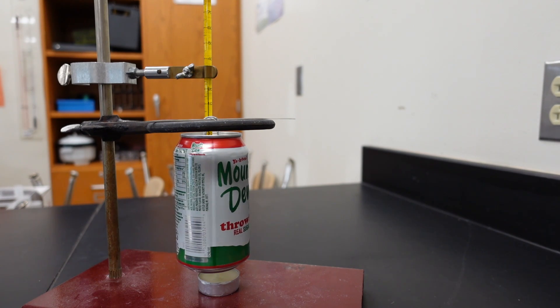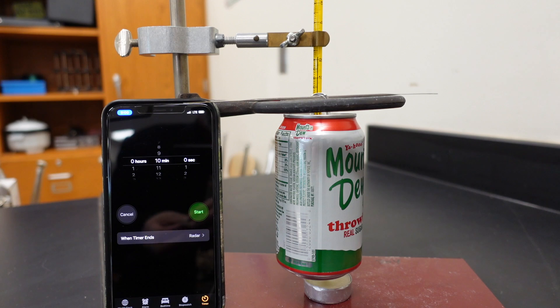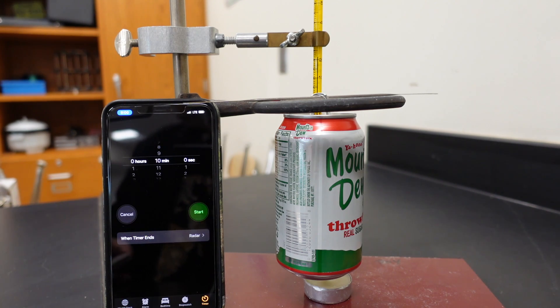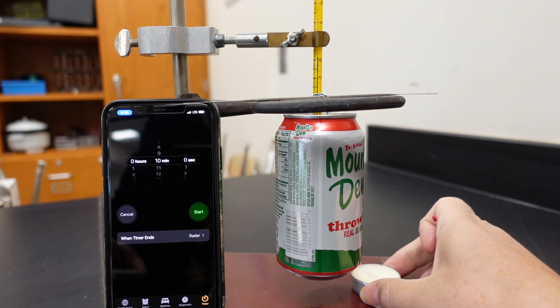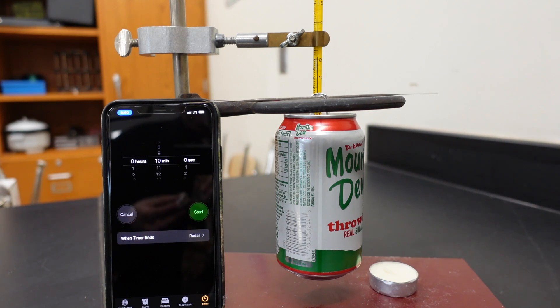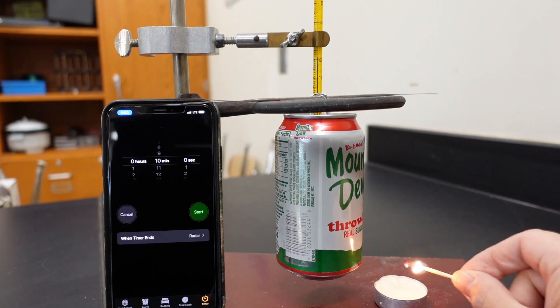Okay, now we are going to let this roll for 10 minutes, so I need to get a timer. Okay, so let's light the match, get the candle out from underneath, light the candle.